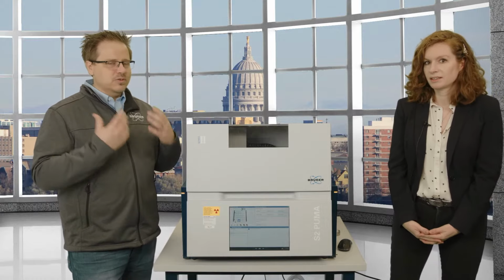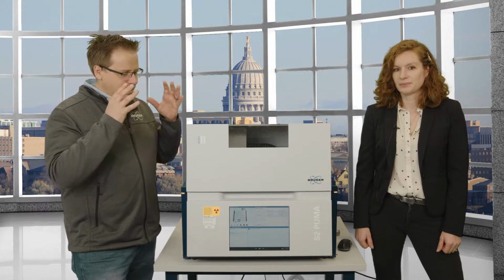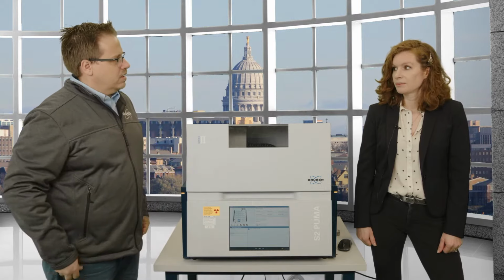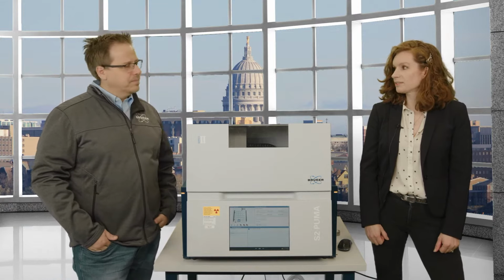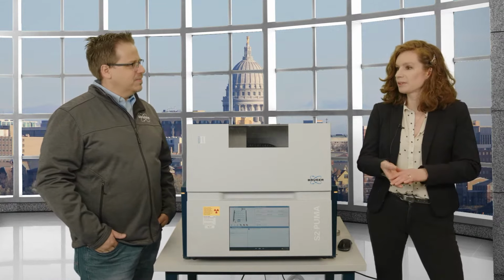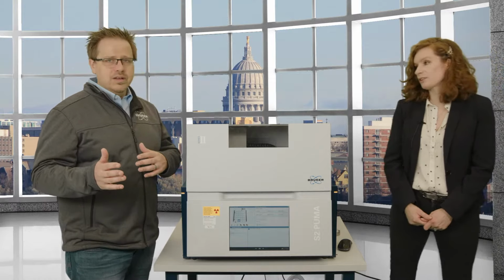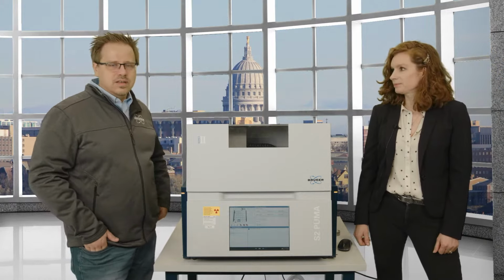And it's kind of interesting too, because when people hear X-ray, I think the first thing that comes to mind is, say you're at the airport and they're checking your bag, trying to visualize what's in it. But here we're talking about something different. We're talking about using those X-rays, but to get the elemental composition. We're looking at bulk composition. We're not doing the X-ray part, looking through things and seeing the dimensions. We also look through things, but for a different purpose. And those are typically much higher energy. Yes, that's true. This one is a lower energy, but that's what gets us that composition.